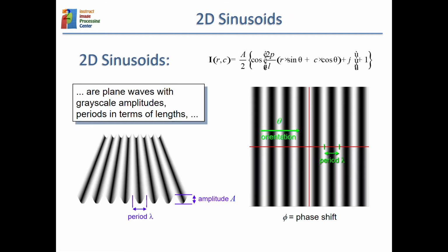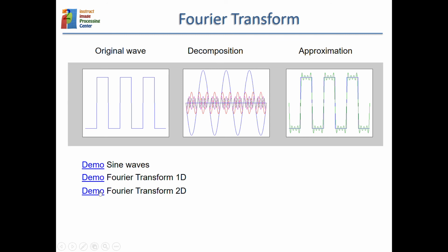And let us see some other ideas regarding these waves. These waves, and again we cannot run it because of Java, have frequency. We have been talking about the period. The frequency is the inverse of the period. We can have waves that are slower. Those are called low frequency waves, and that would give you the overall shape of an object.